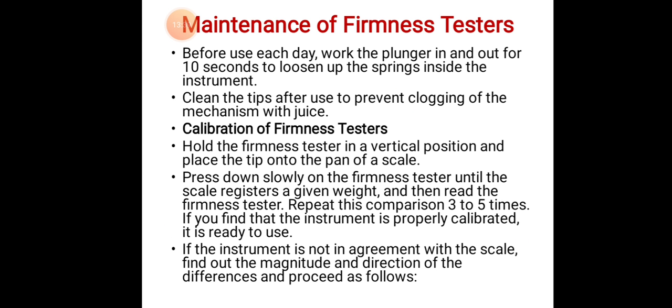Maintenance of firmness testers. Before use each day, work the plunger in and out for 10 seconds to loosen up the springs inside the instrument. Clean the tips after use to prevent the clogging of the mechanism with juice.